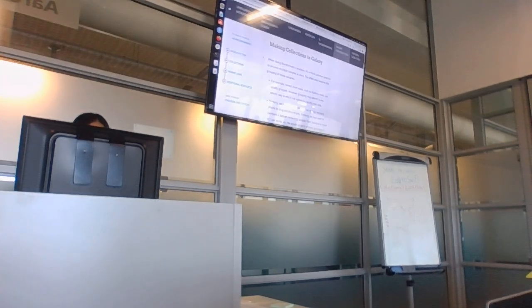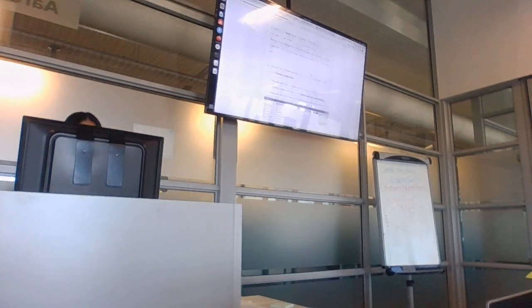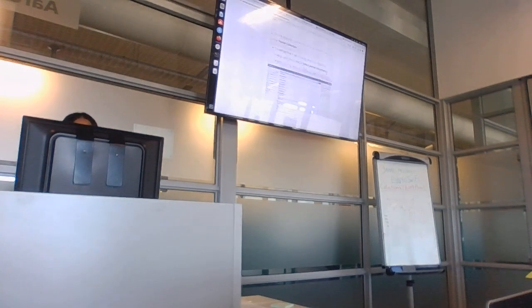And then the workflow is here as well. It shows you will run FastP, then MultiQC. The only thing is, I didn't put the options in for MultiQC, but MultiQC didn't have any parameters. You just search for it and then you put the paired collection in and you ran it. But I will put it in there for clarity.